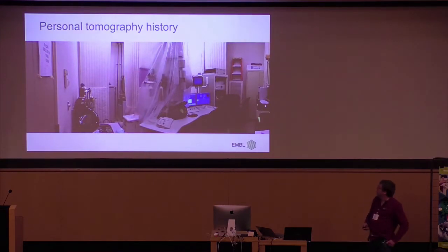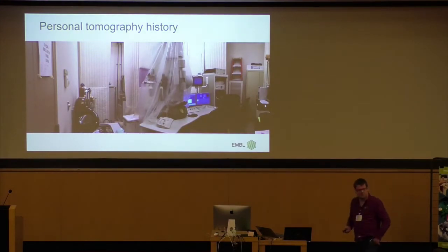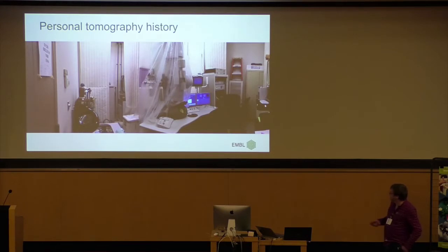So, this is a Polara. It's one I built myself. It was shipped to Sriram Subramaniam in 2002 or 3, I think, when I was working in the FEI factory building these things. We also had to install them. And one of the things that happened in these years is that this new thing came up, automated tomography. And that's where I first got in contact with it.